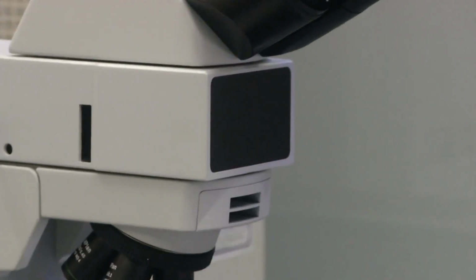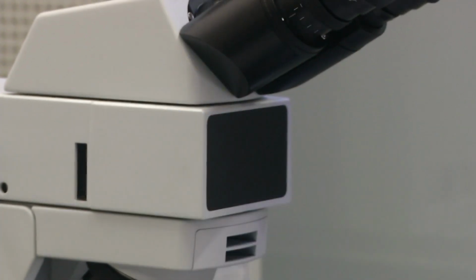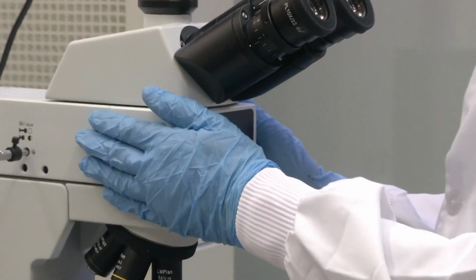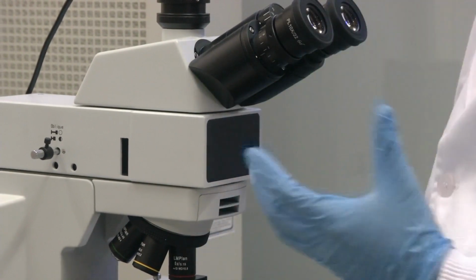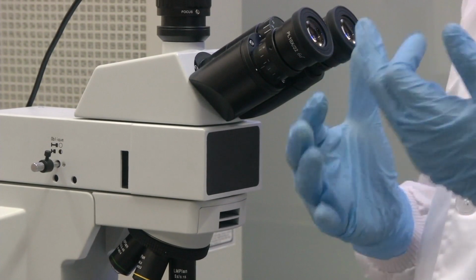You can see, right? Similarly we have blue, less than 480 nanometer. Likewise you can use these filters, insert them into the corresponding slots in your microscope and use it. So when we tell this, we need to discuss fluorescence microscopy.